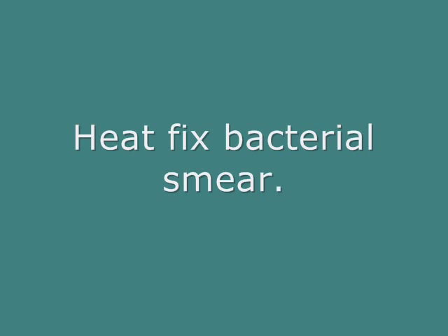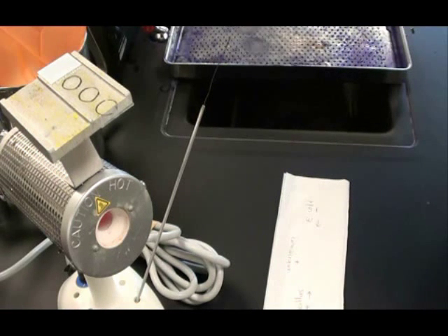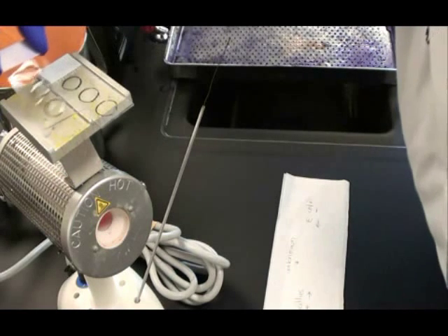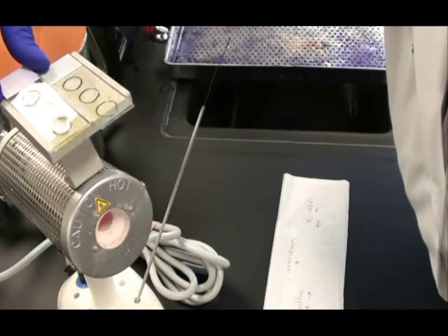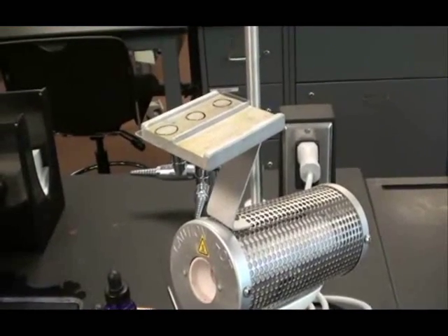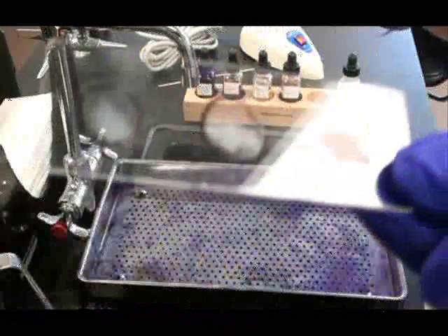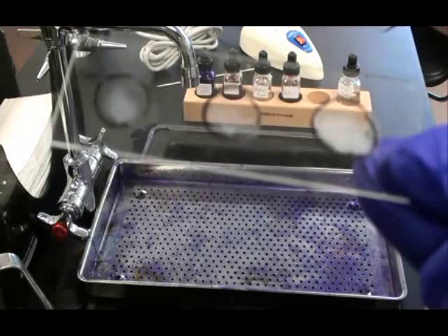Now I'm ready to heat fix my bacterial smear. I do this by placing it in the slide holder on top of the micro incinerator. It will need to sit there for about five minutes until the water completely evaporates. Heat fixing kills the bacteria and makes it adhere to the slide so it won't rinse off when I stain.